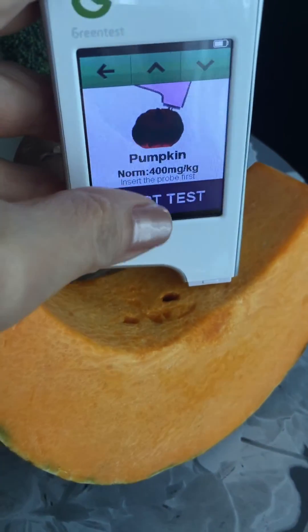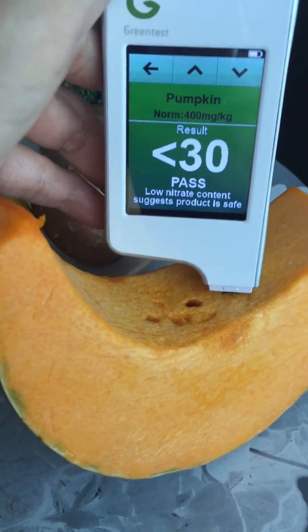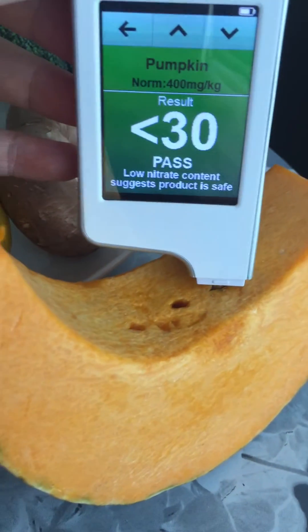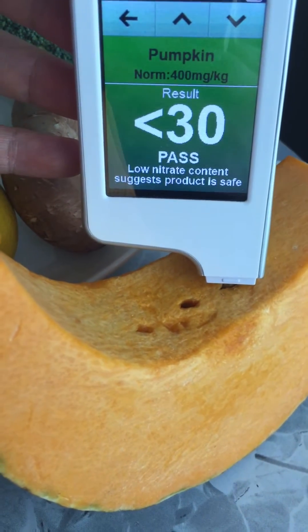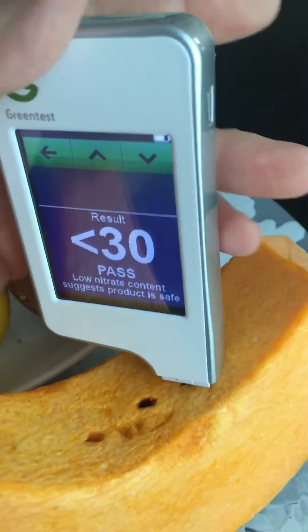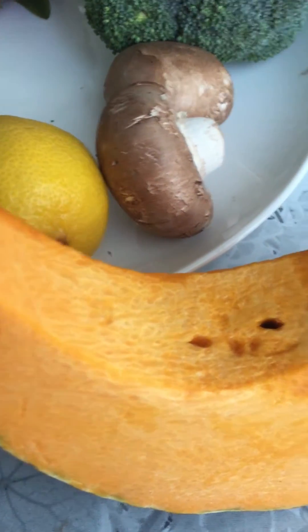Start! Yes — the organic pumpkin passed the test! The normal is 400 mg and this one is less than 30. Wow, fantastic. Love my pumpkin.